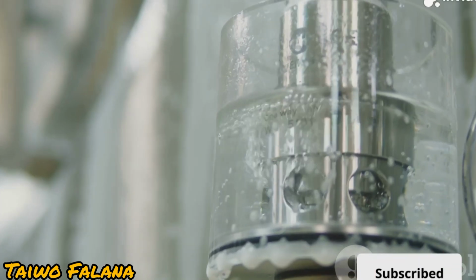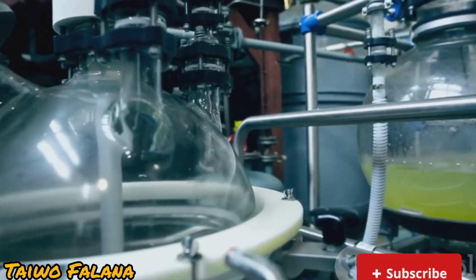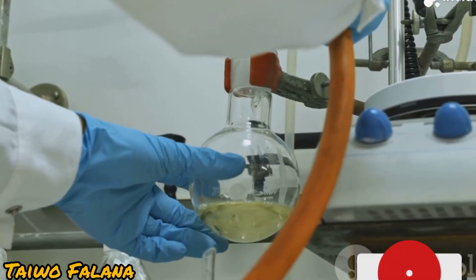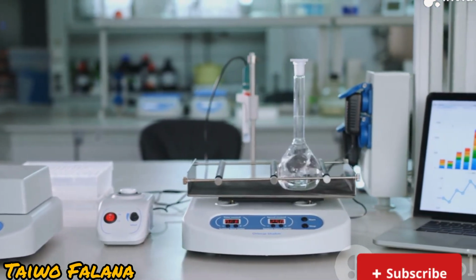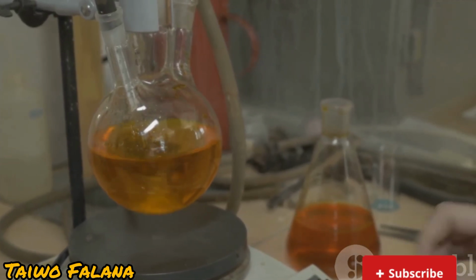But before you collect it, the gas gets washed through distilled water to scrub out any sneaky hydrochloric acid, then dried using concentrated sulfuric acid. Why? Because CO₂ must be pure and dry for most tests. We collect the gas by letting it push air upward. It's heavier than air, so it easily sinks.